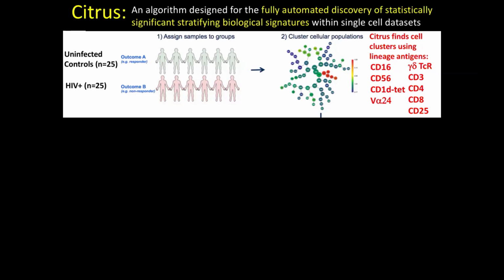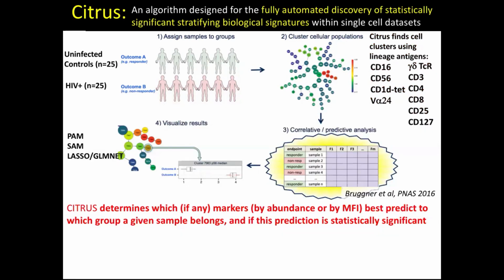The tree that you see here has a lot of redundancy because the same cell is included in multiple parent-child clusters, and you can expect that clusters that contain the same cells will correlate with the same endpoint. But Citrus modeling actually corrects for correlating features, so that is not a problem for calculating significance of your results. We use modeling approaches that are built into the Citrus pipeline to find statistically different signatures in our cohorts.